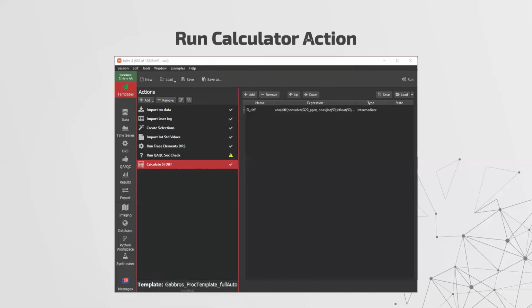I mentioned that you can calculate your own channels, and as an example of that, which I won't run for sake of time, we have an example here where we've calculated the silica gradient. And the reason why this could be really handy is because if you look at the gradient of a channel, it doesn't necessarily matter what the content is, just more where it's moving quite quickly. So for example, in our gabbros, we can have different contents for silicon in our plagioclase and in our CPX, but where we have drill-throughs, that gradient will be quite high.